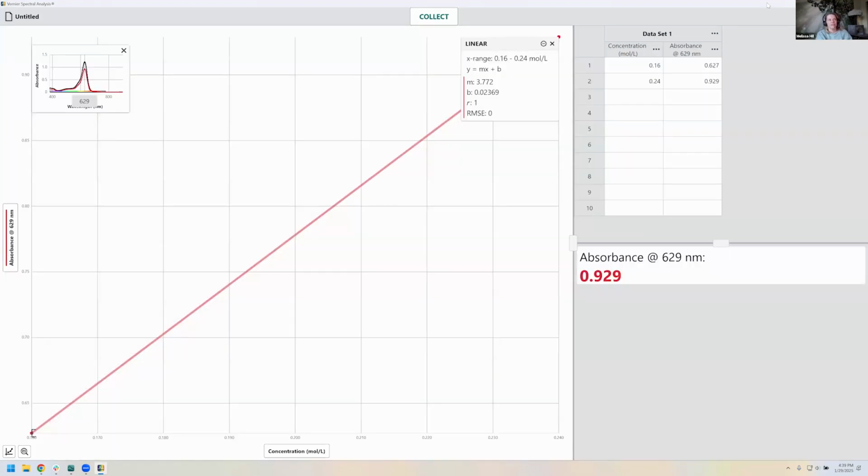But the tour of the app is very similar. So you have the gear up here, which shows your spectrometer collection settings. The box of boxes, again, is where you would turn on and off meters, tables, and do up to 3 graphs. The ... tells you the software. And then down in here is the graph options. If I want to save and export, I do that up here.